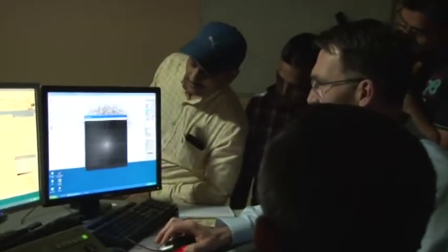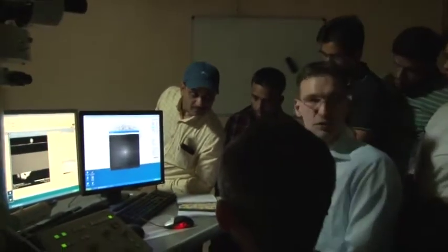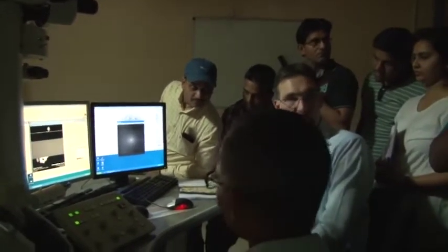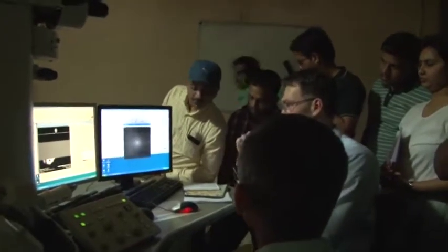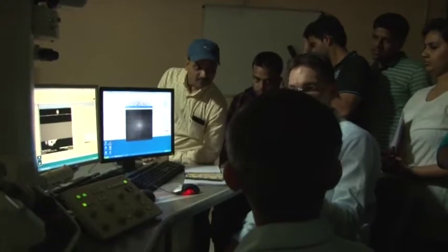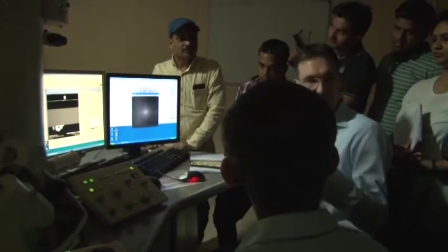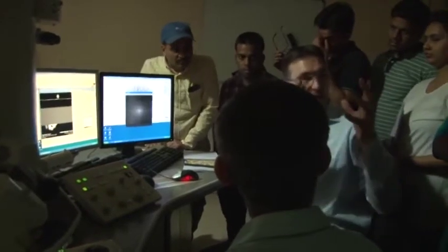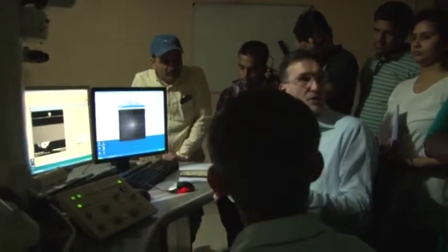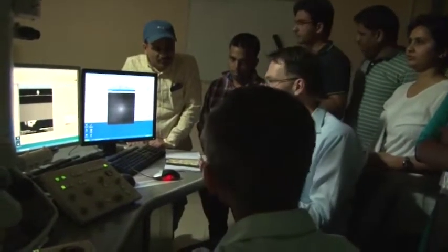The Fourier transform directly shows you the contrast transfer function, or the square of it, which we are going to explain next week. This transfer function explains how well specific frequencies from the real space are transferred into our image, from our exit wave function below the sample.